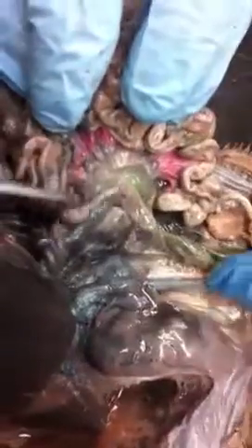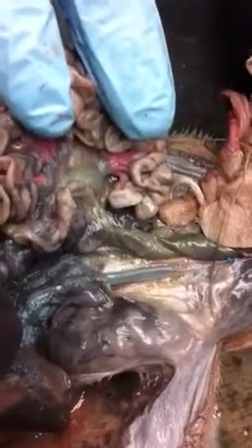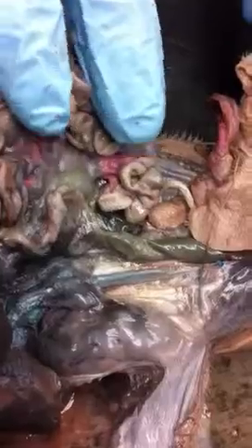the liver. Yeah. So it's undoubtedly in here someplace. But I think maybe we can forget about that one. Cross inferior mesenteric off the list. Alright. These are veins, right? Yeah.